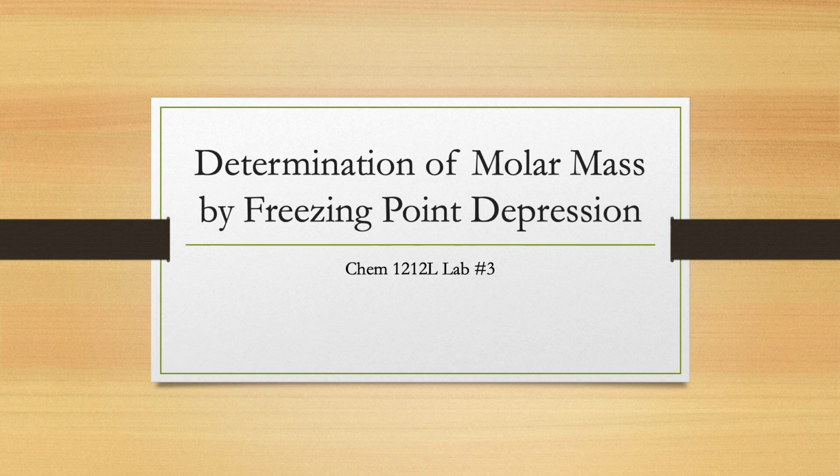All right, welcome to our third pre-lab video for the 12-12 lab this semester at North Georgia. This week we're going to be taking a look at the determination of molar mass by freezing point depression.